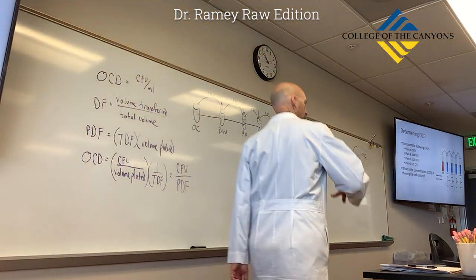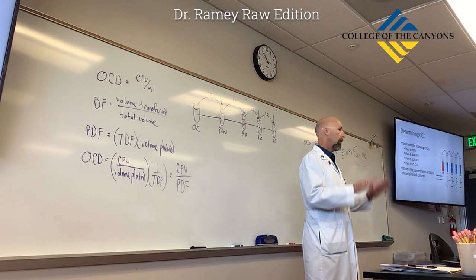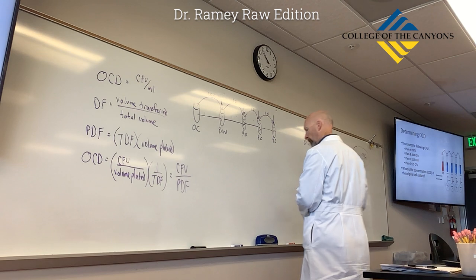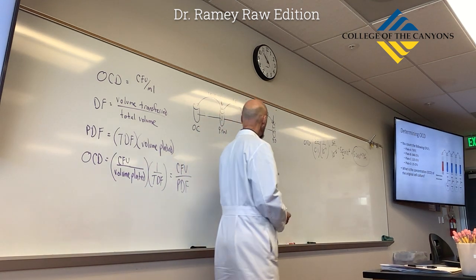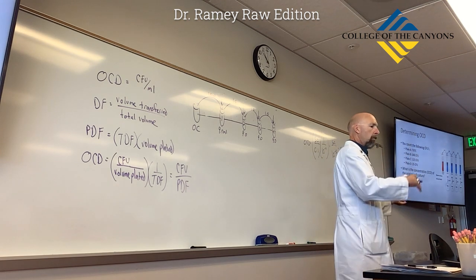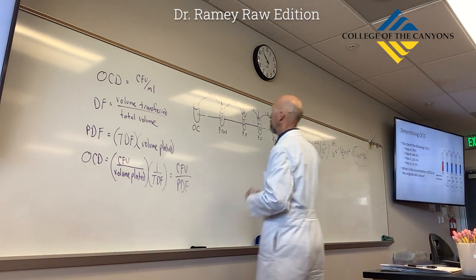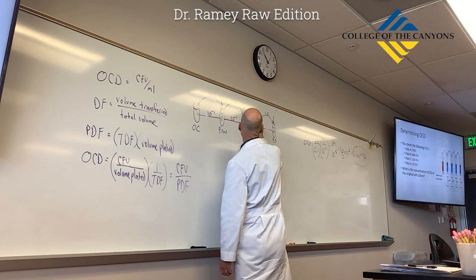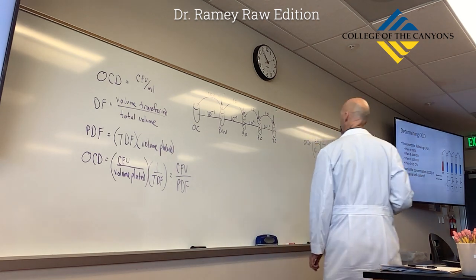I'm seeing several correct answers, but I'm also seeing some of you making some common mistakes. So I'm going to try to give you some pro tips that'll help you avoid those mistakes. First of all, let's go through this, okay? So you've got 4 dilution tubes. They're all 1 mil transfers into 9 mils of diluent. So those are all 10 to the minus 1 dilutions, right? Just like in the last problem we were looking at.